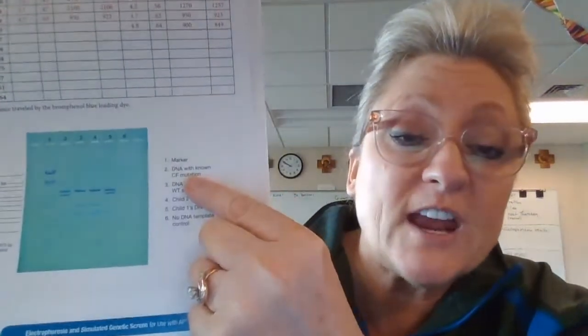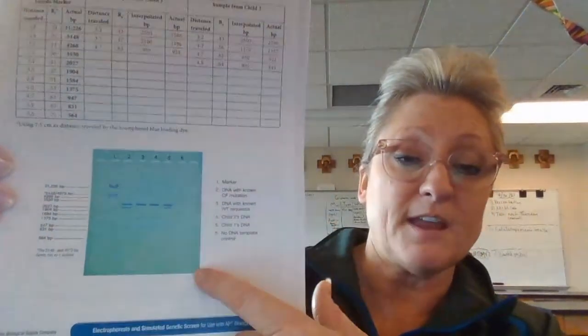So for example, we only care about child 1 and child 2 because the other two were known. We had a known CF mutation, and wild type is somebody who does not have the cystic fibrosis mutation. So those are the banding patterns for those two. We're interested in child 1 and child 2. Well 4 is child number 2, well 5 is child number 1, and in well 6 there should be nothing because that was a control, where there shouldn't be any DNA whatsoever. And so how do we interpolate that?